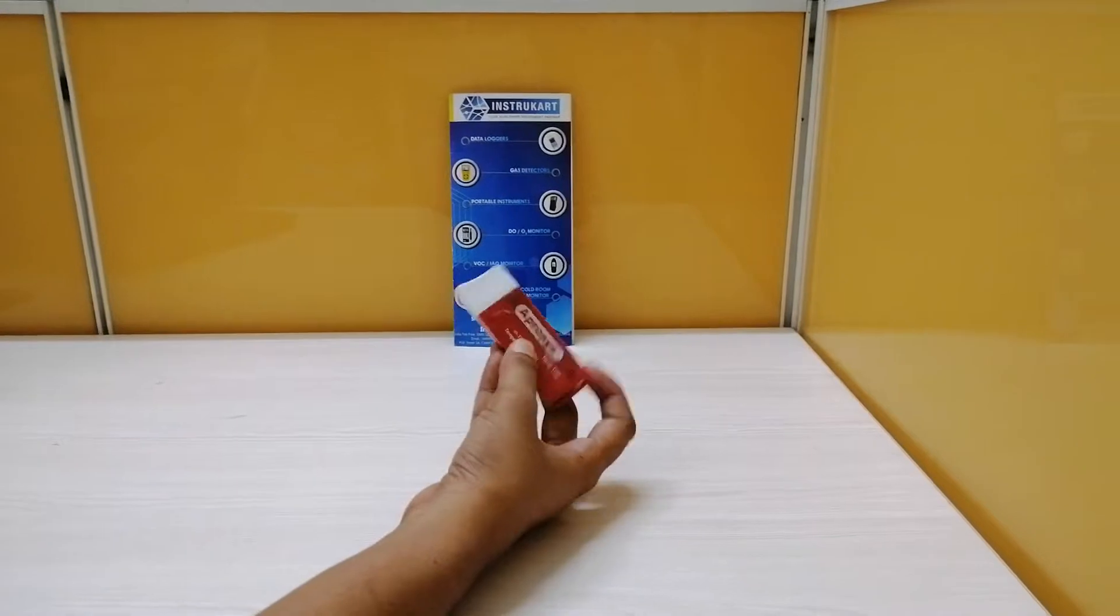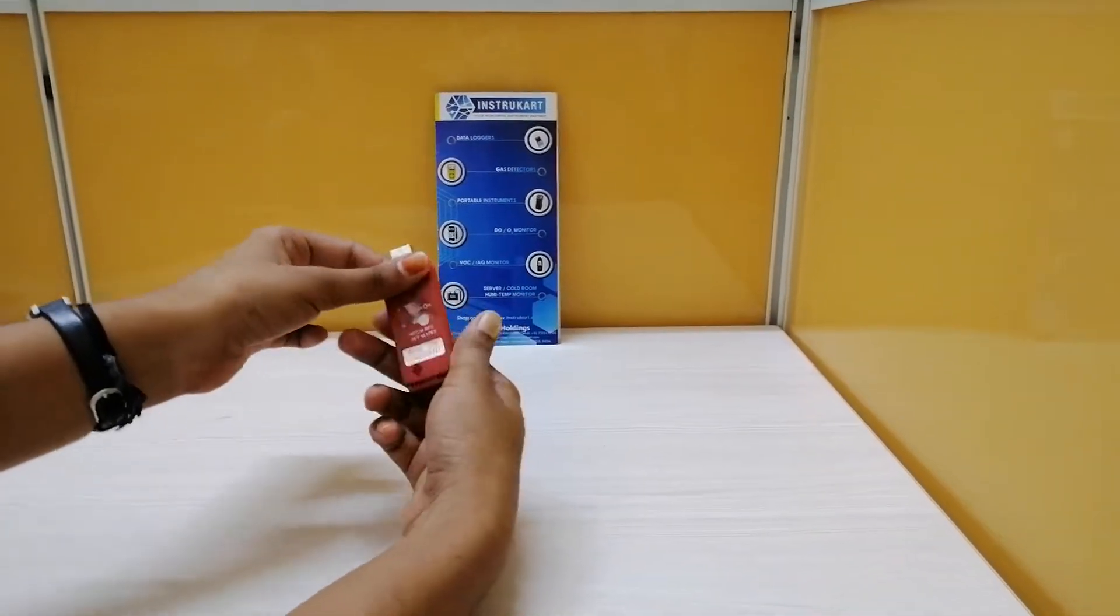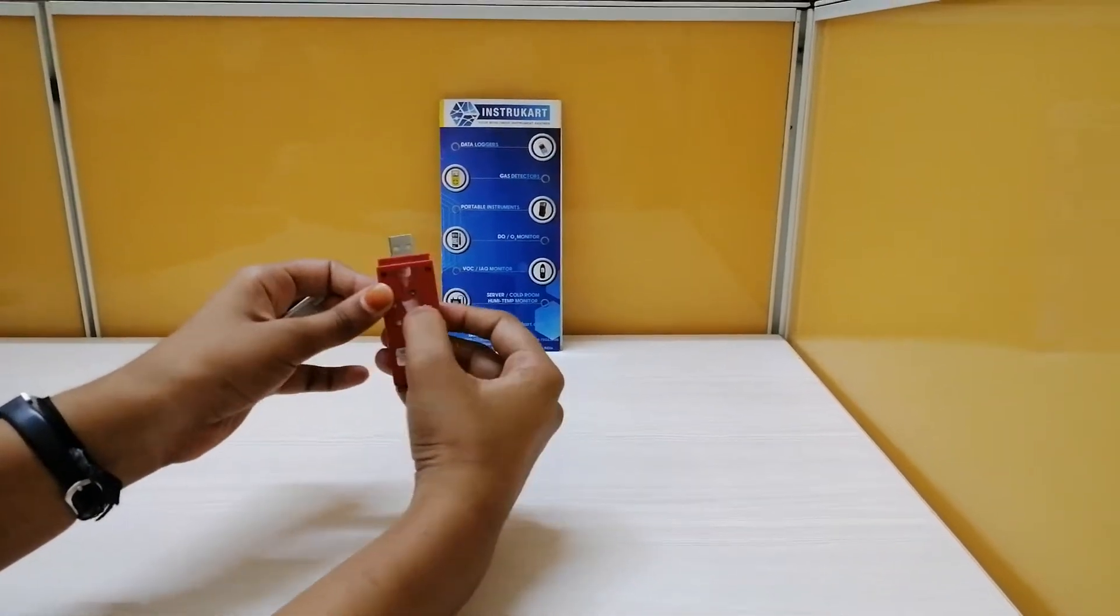This has a USB port. This is the USB port. To turn on the data logger, you have to push this button for 5 seconds.